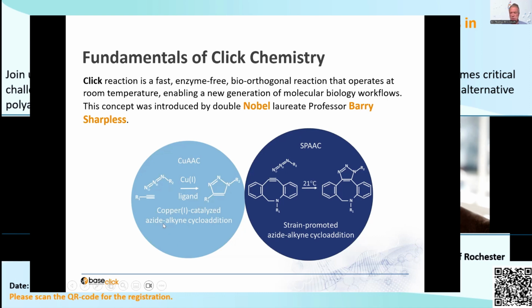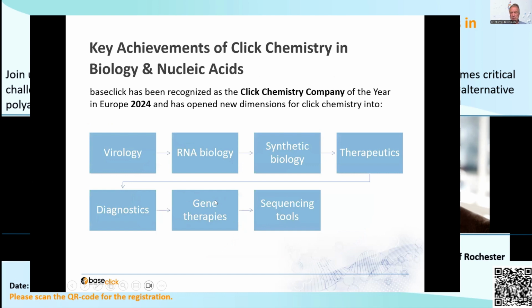However, in click chemistry there is also a non-copper click reaction type, a so-called strain-promoted click reaction, which was developed by Carolyn Bertozzi. Both, along with Barry Sharpless, also Meldal and Bertozzi, received the Nobel Prize for this reaction type. As you can see, it is more or less a conjugation between an alkyne group and an azide group, which gives this triazole linkage.